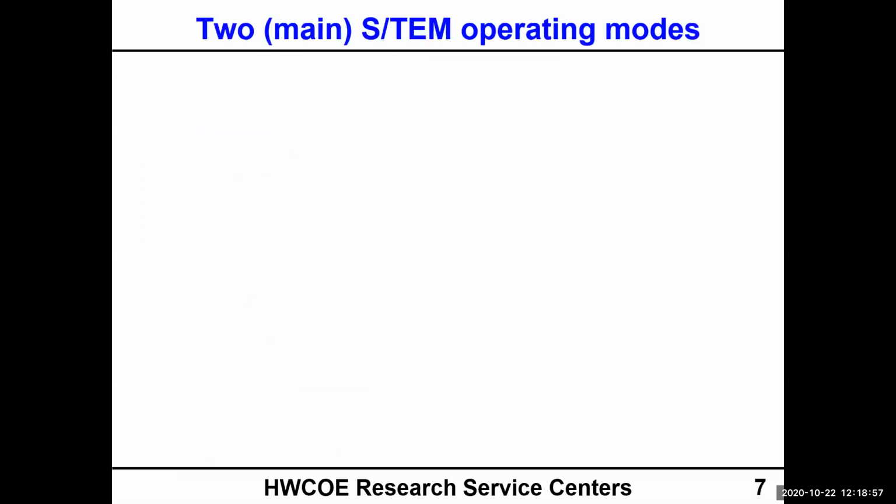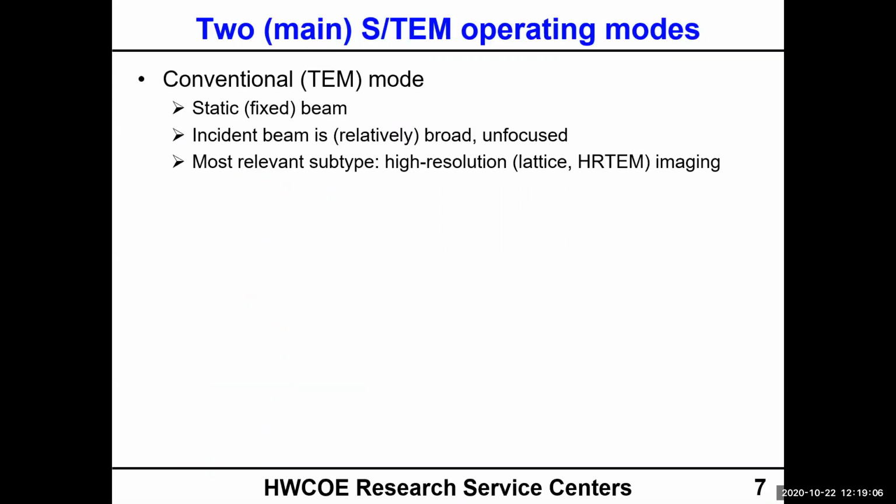Okay, so a little bit of a sidetrack here. When we're talking about STEM operating modes, we have two main ways we can do this. So the traditional way was in conventional mode, otherwise known as just TEM mode. That's where you have a fixed or static beam.